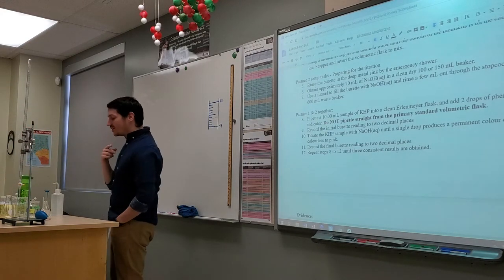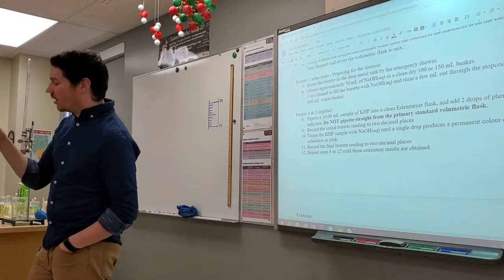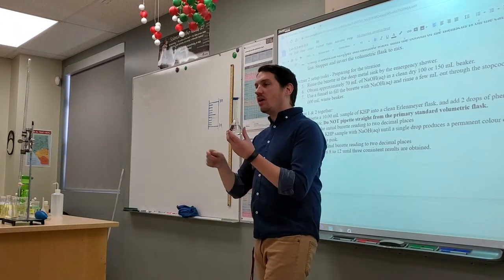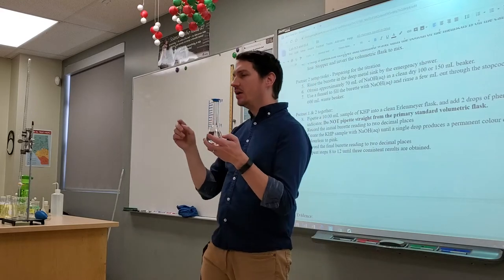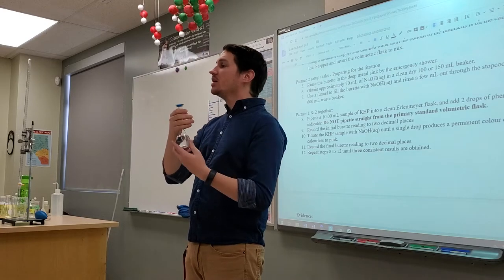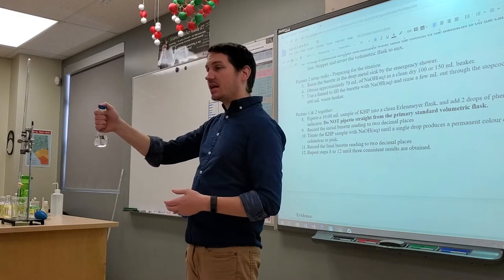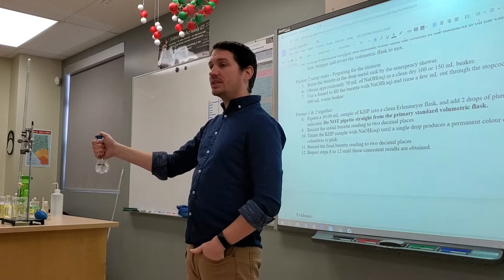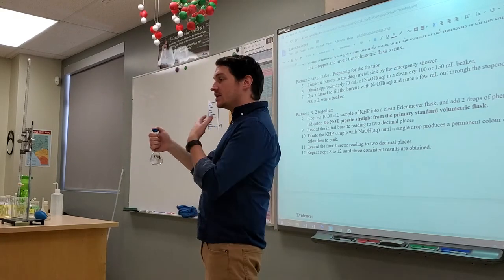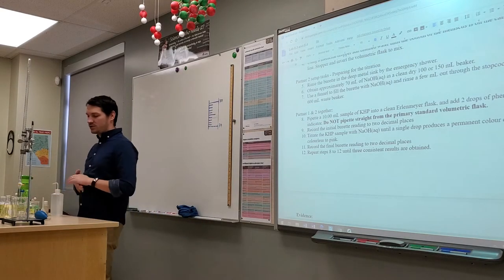So here's the idea: your primary standard, because it's been sitting for a little while, there is a small chance that if you did not totally mix it properly the first time, some of the more dense parts of the solution have moved down to the bottom. So the first thing I would do, as soon as you go to grab your primary standard, is cap it tight and invert it another 3 times. You don't have to do it 10 times, but I would invert it another 3 times, just to make sure that, yes, that KHP is uniformly distributed amongst your solution.